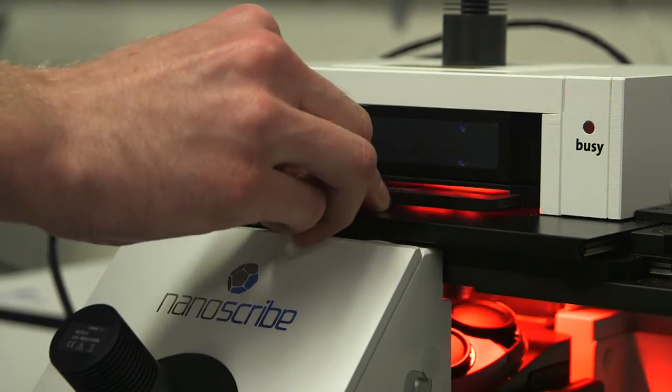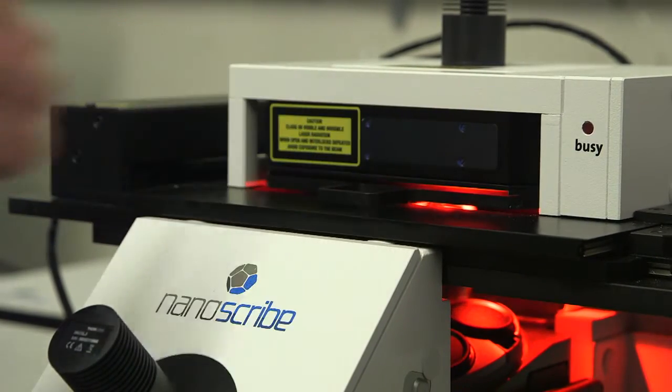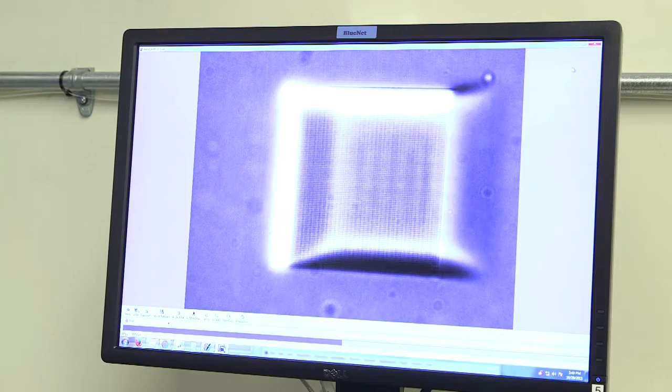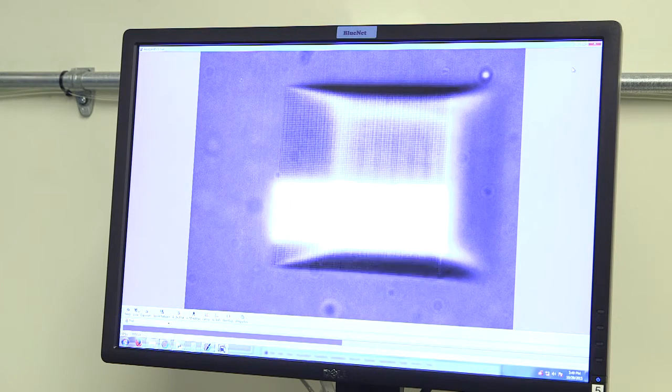Here we use two-photon polymerization direct laser writing, which uses a tightly focused laser to locally polymerize a resin, and by moving the laser focus, you can write a structure.